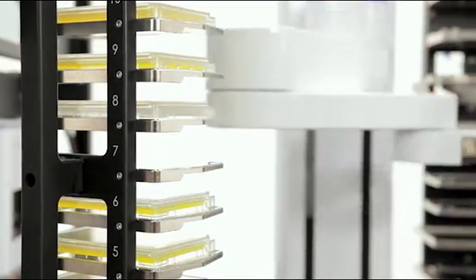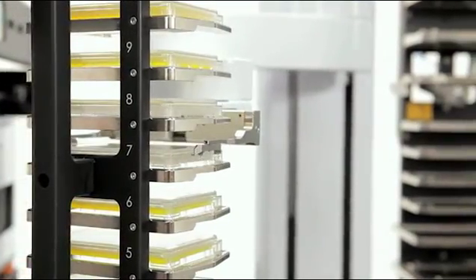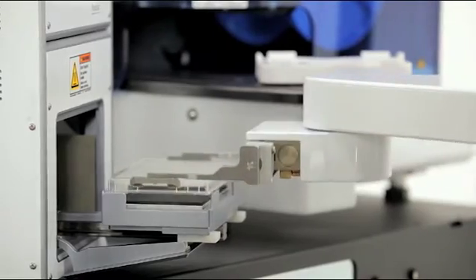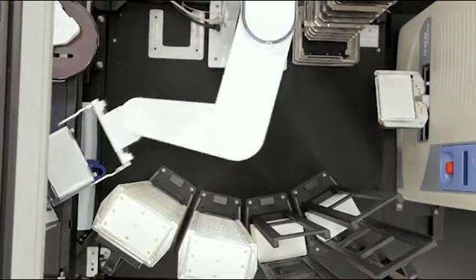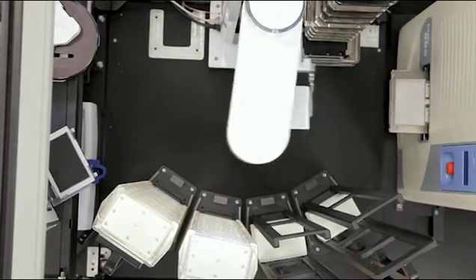Each configuration of the Access workstation is optimized and tested against target applications, arriving in your lab ready to go after installation.